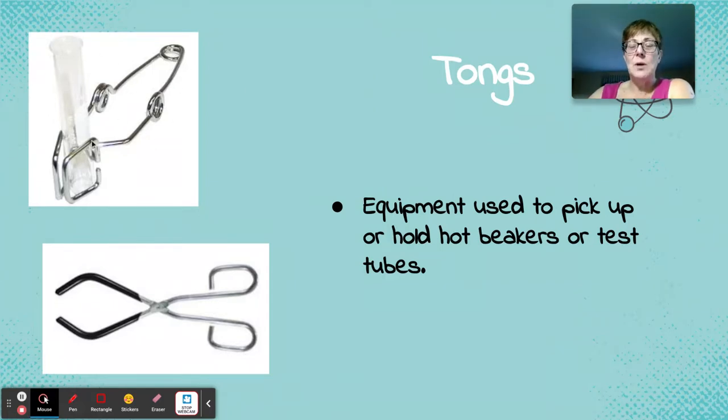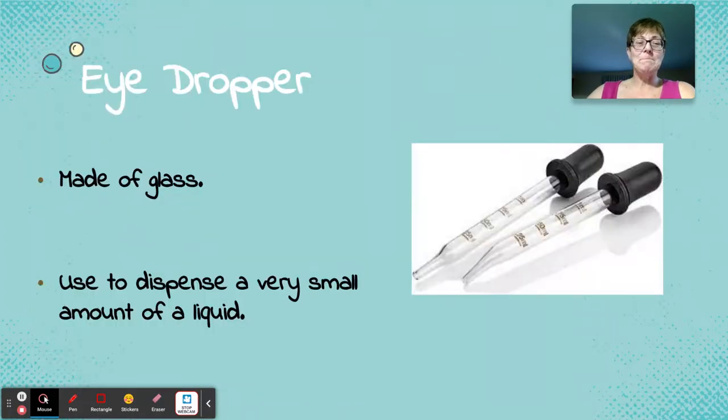And I have some and we'll show you and you'll be able to test them out, okay? And I have some of these. They have plastic on them and that's so that it grips the beaker. Because they're usually bigger mouths, openings, and it's just easier to have some friction to hold those beakers in place, okay? So we got tongs, pretty cool.